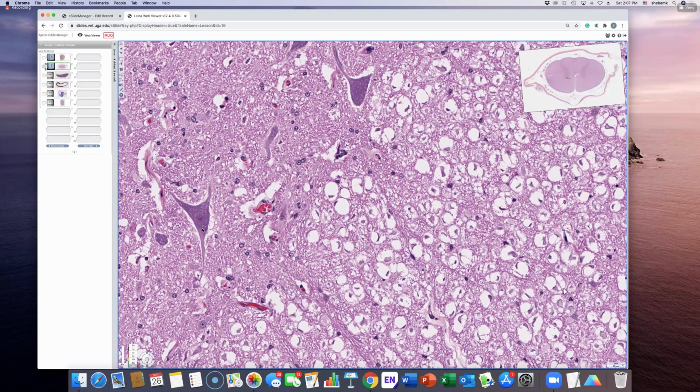Yes, very good. So this place where the axon takes off is called the axon hillock. Okay, where it's taking off. So that's the axon hillock, no Nissl substance in this process. So we're going to safely call that an axon. Okay, some more neurons right here with a beautiful euchromatic nucleus and a nucleolus. All these are nuclei of oligodendrocytes, glial cells to be safe. You would call it an oligodendrocyte if the chromatin is kind of marginalized like these.